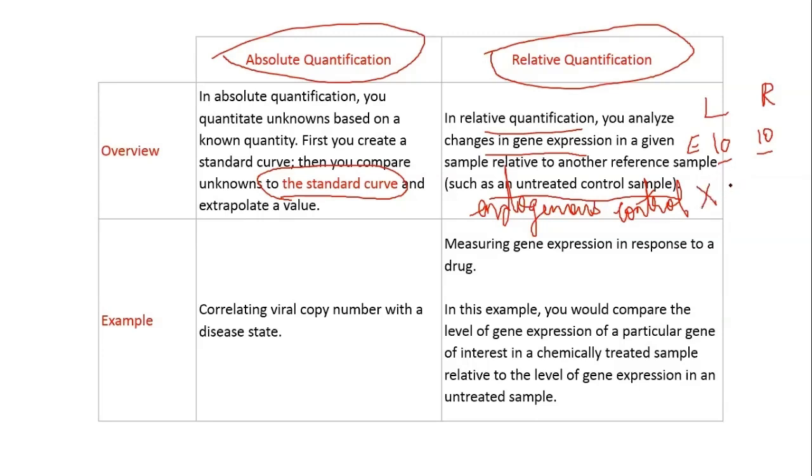So gene X can vary. It can be 5, it can be 1. It may vary depending upon how much it is being transcribed. So even if by mistake you're taking different RNA levels in root and leaf, it gets nullified. You do 10 minus 5, 10 minus 1. There is a formula to nullify the minor errors in RNA concentration because it gets nullified using your endogenous control genes.